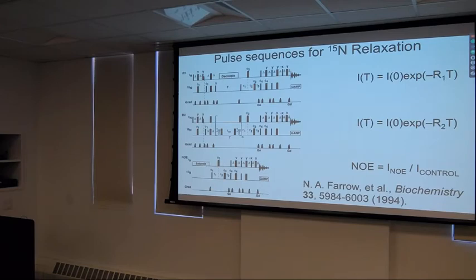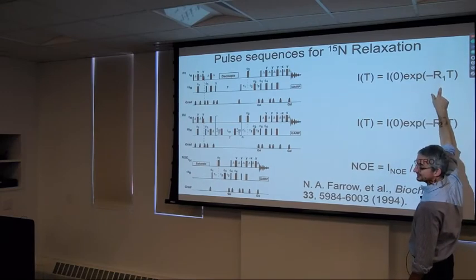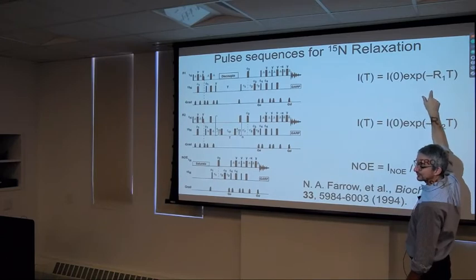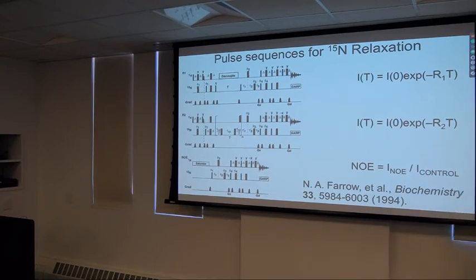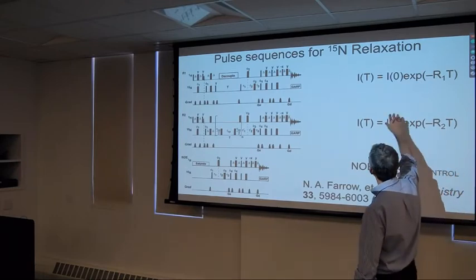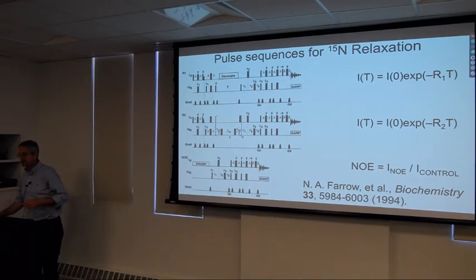And that's pretty inconvenient, but since we're acquiring both, if we subtract the two, this goes to 0. The long time value becomes 0, and we just have to fit an initial amplitude and a damping constant. So that's almost always done in order to reduce the number of parameters, and also trying to figure out what this long time scale value is isn't so easy. So that's why this looks a little different from the inversion recovery expression that I showed earlier in the beginning of the class.